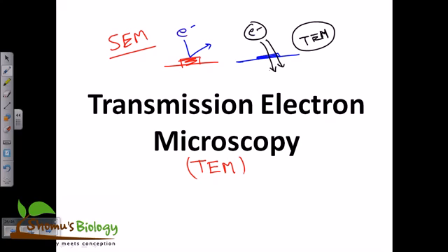So then the electron will transmit through it, and as the specimen is very thin, the electron can pass through, with the help of the fact that electrons have a much shorter wavelength. So in that case, the electron can easily pass through, and the electron is scattered by the presence of different proteins and different structural properties of the cell, and the detector can detect it, and it can create an image of that ultra thin segment in much better, higher resolution.